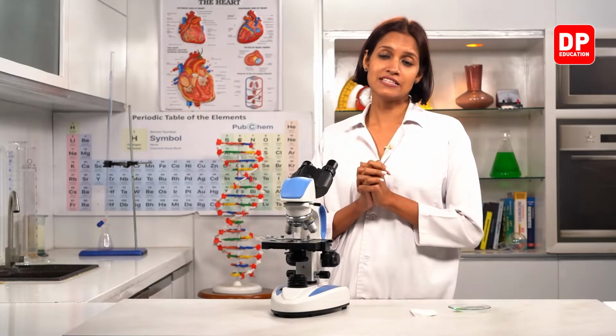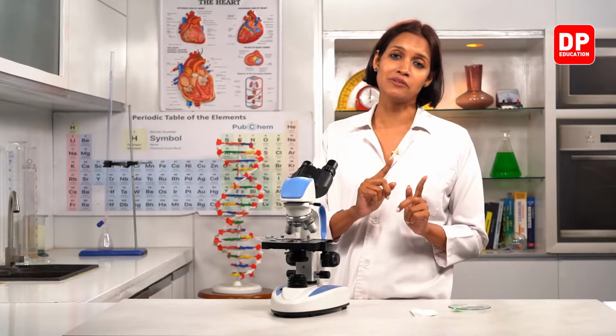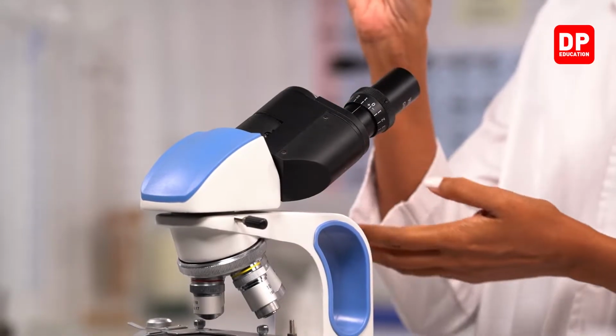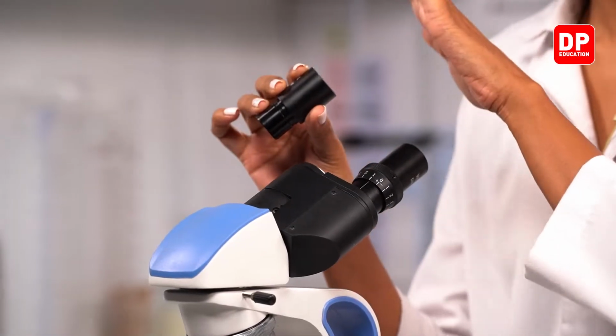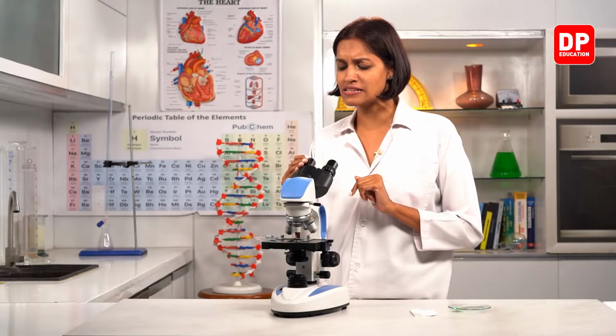And the other thing is, children, we should never change the lenses of one microscope to another microscope. Even earlier I showed you all, we can remove these lenses, right? So we should never ever change one of these lenses to a different microscope. What is the reason?